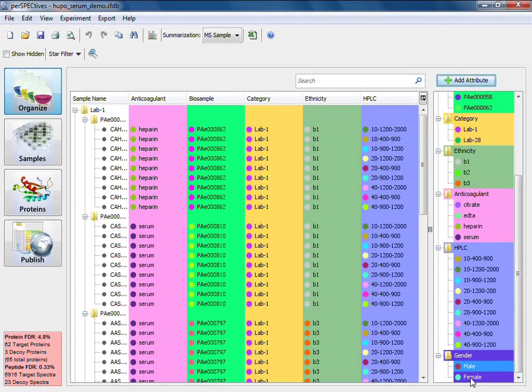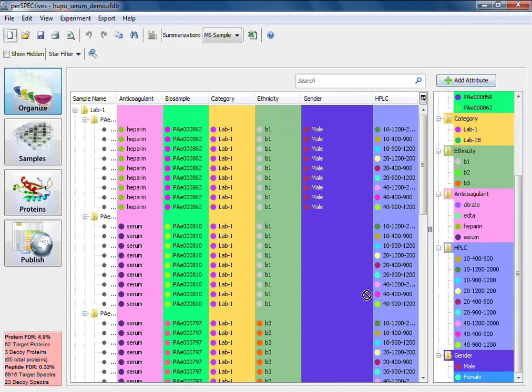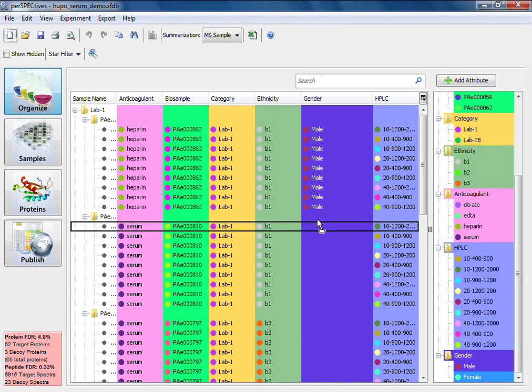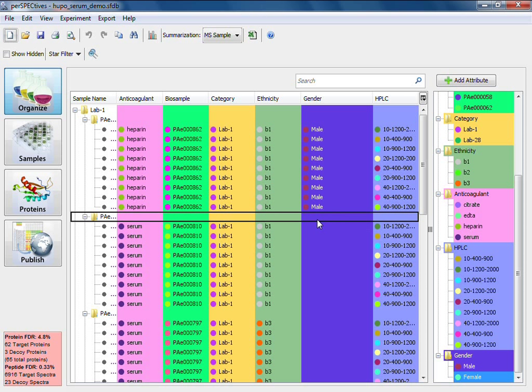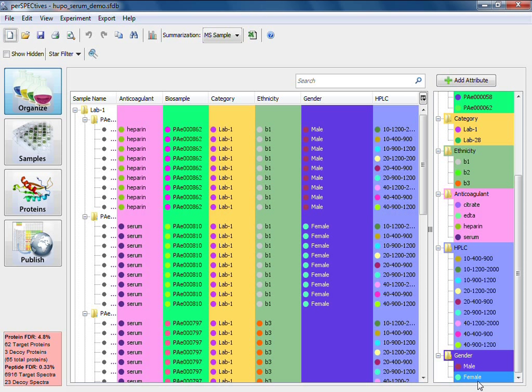You can also easily modify your attribute tree structures in order to look at your data at different levels of summarization.